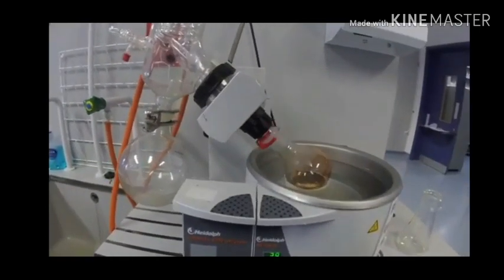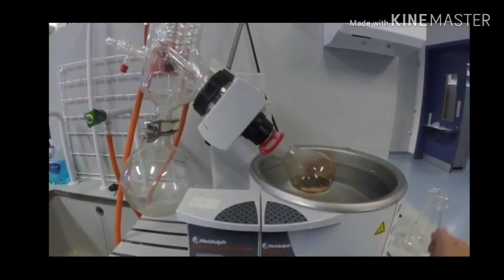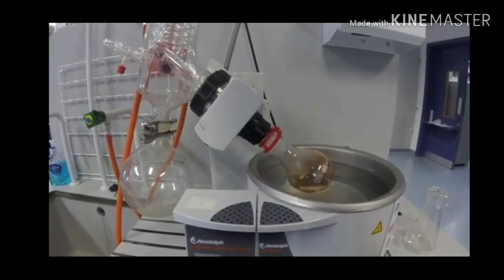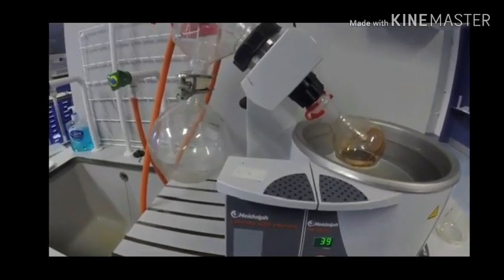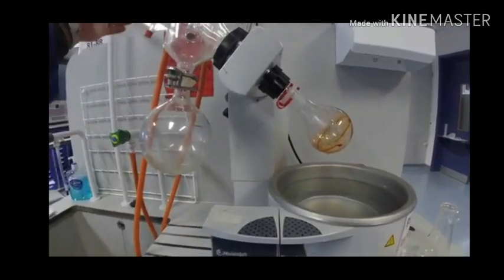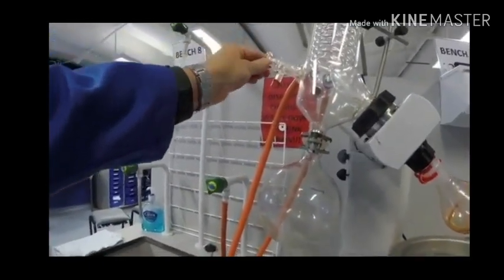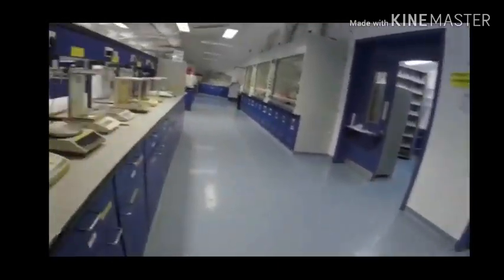Okay, so we've got to the end of our evaporation, and we can now see that all the solvent has evaporated, everything's gone. We'll slow that down, stop, and then we're going to raise it up out of the bath. Next thing to do then is to open this tap, and it'll help release the vacuum, and we can go and switch the vacuum off.